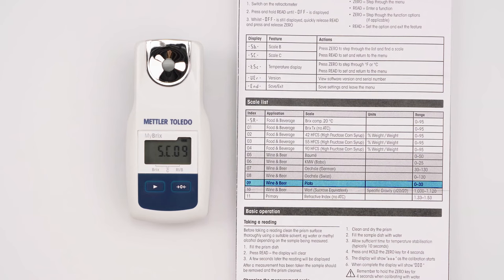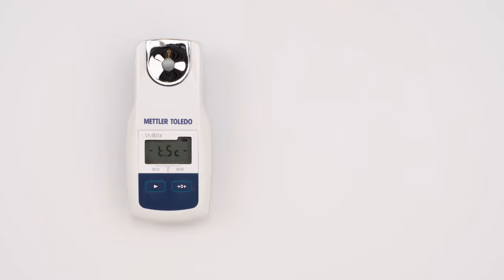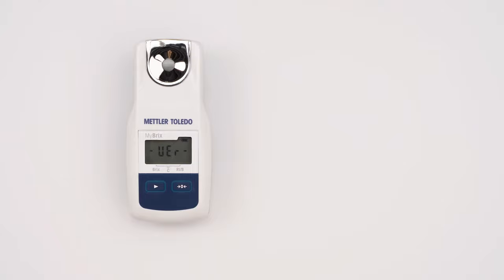To confirm, press the read key. Similarly, the preferred temperature scale can be selected between Celsius and Fahrenheit. Navigate to end with the zero key and press read to close the menu.